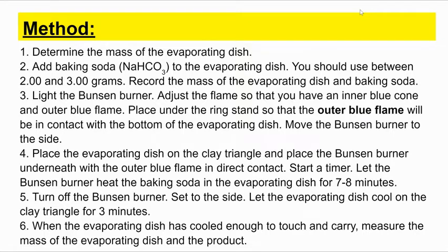The method for this lab is as follows. Determine the mass of the evaporating dish, and then add baking soda to the evaporating dish using between approximately 2 and 3 grams of baking soda. Then record the mass of the evaporating dish with the baking soda.